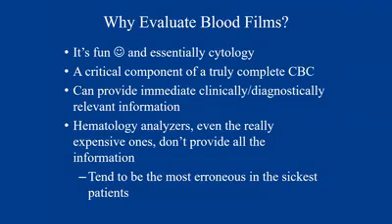We are methodically looking at cells under the microscope and classifying things and grouping things to get to a diagnosis. And I feel like sometimes hematology is like the redheaded stepchild of cytology, but it can be very diagnostically beneficial and it really has an important part in veterinary practice. It's a critical component of a truly complete CBC. It can provide immediately clinically and diagnostically relevant information.